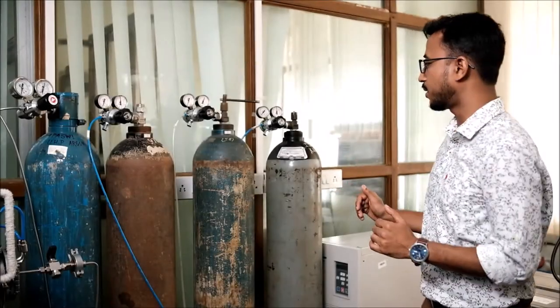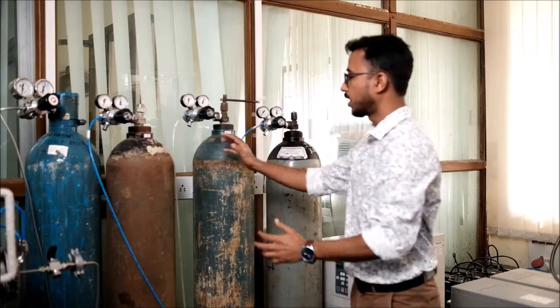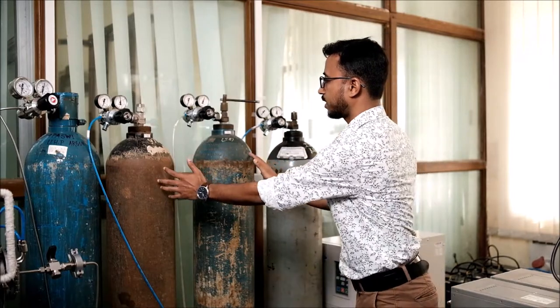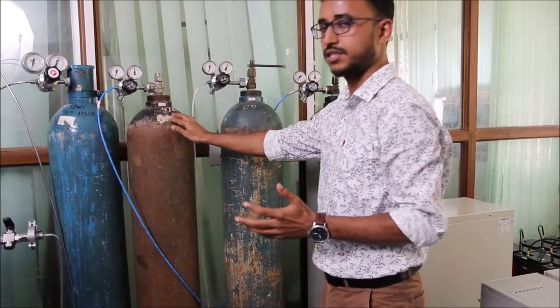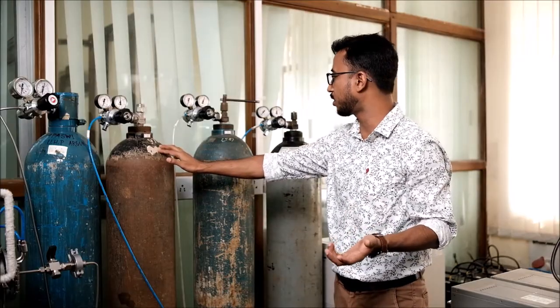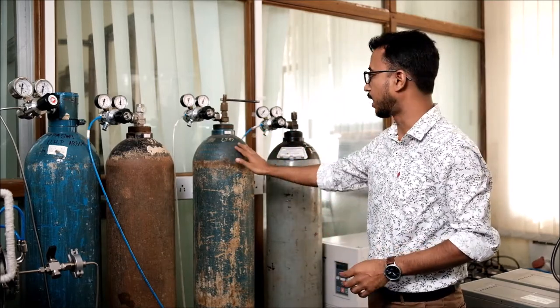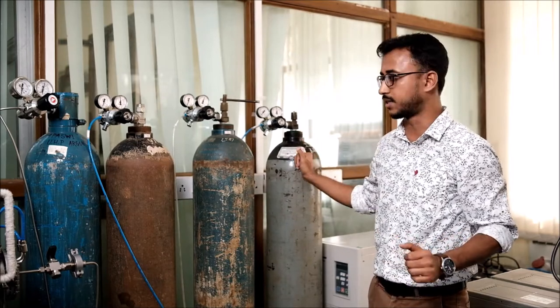In the gas unit system, we have three cylinders for three different gases. One is oxygen, then argon, and then nitrogen gas. Oxygen and argon are used for the actual deposition system. Oxygen is used while doing reactive sputtering deposition, and argon is required to sputter the system, so we always supply argon gas. Nitrogen gas is used for venting the system.